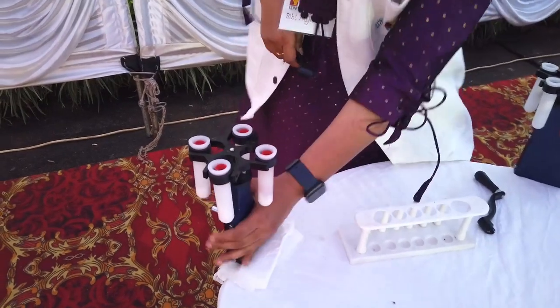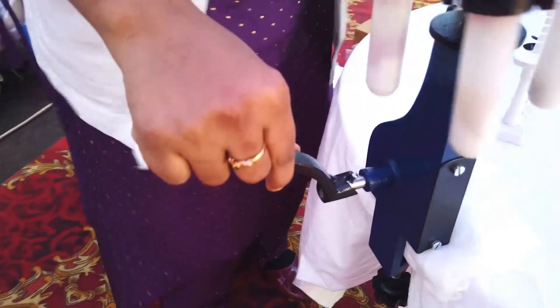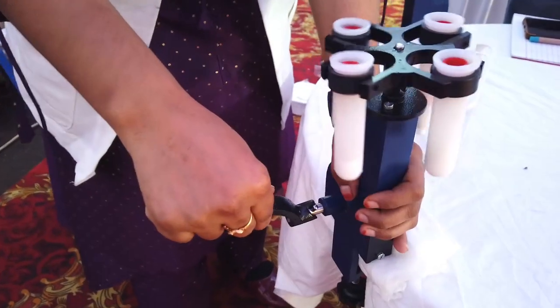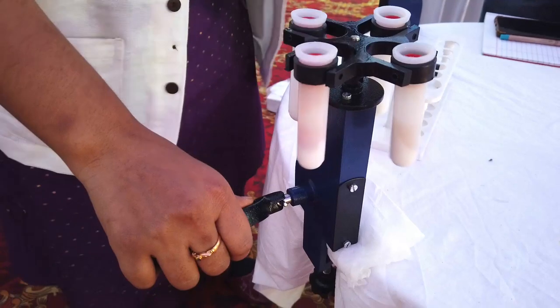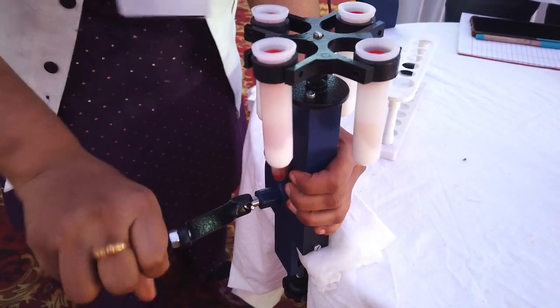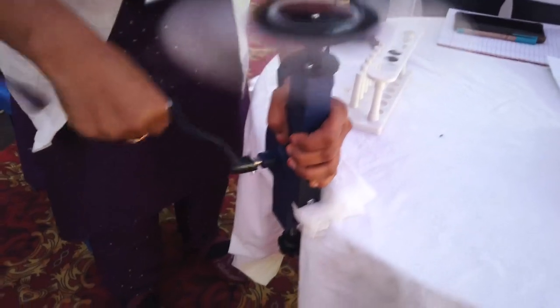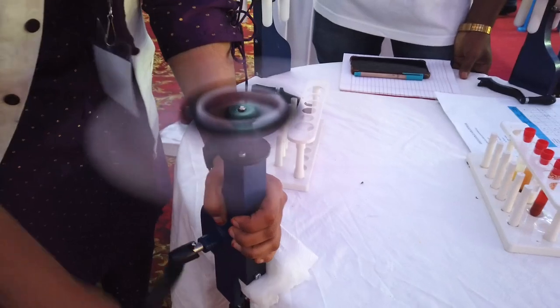I'll place these plastic test tubes into the centrifuge tubes like this, take the handle, and place it here. I have to hold the centrifuge body so that it will support and not come off while rotating — there are chances it will come off, so that's why I have to hold it like this.